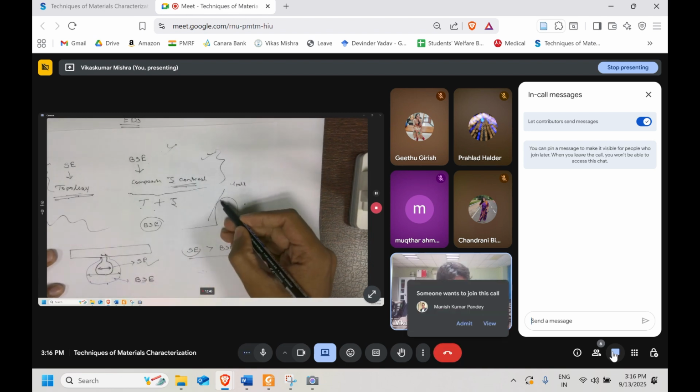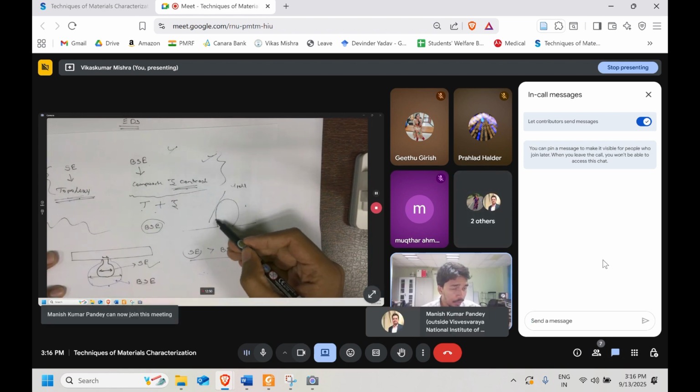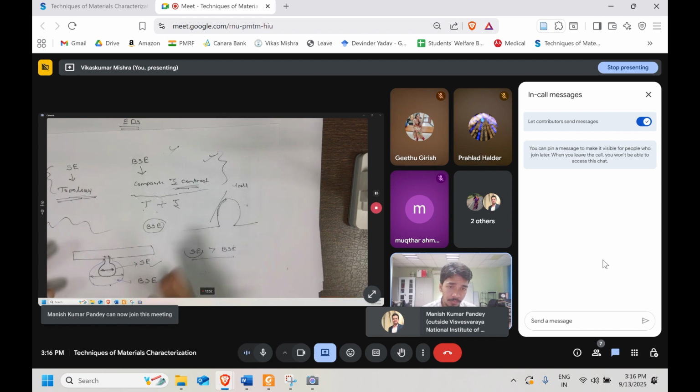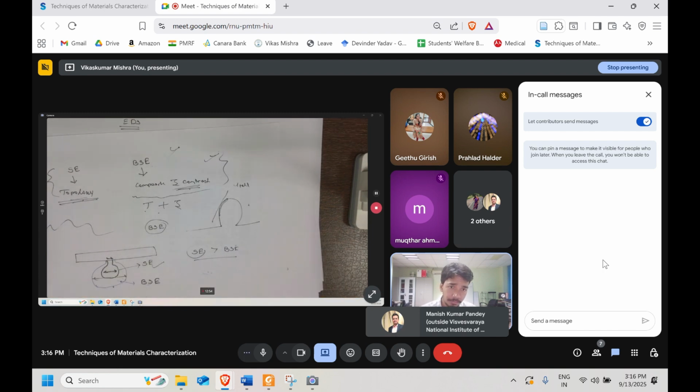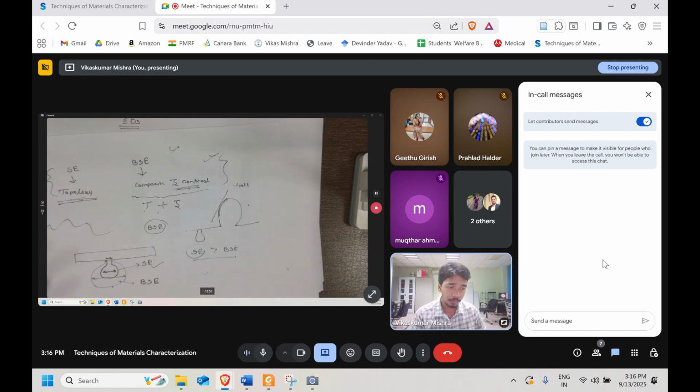Like let's say this. So if I am getting more yield, more electrons, I can say that this is appearing brighter, while if this is giving low, it appears darker. Your specimen itself has a variety of asperities, so a variety of angles. Depending upon that, the electrons will scatter in different directions. So you will be able to get all of them depending upon how the trajectories are.